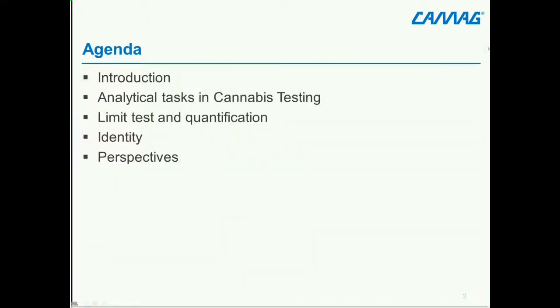The content of today, our agenda: we will first see the introduction, then talk about the analytical task, especially in cannabis testing. Limit test and quantification will be explained, then how to perform identity testing and the perspectives.